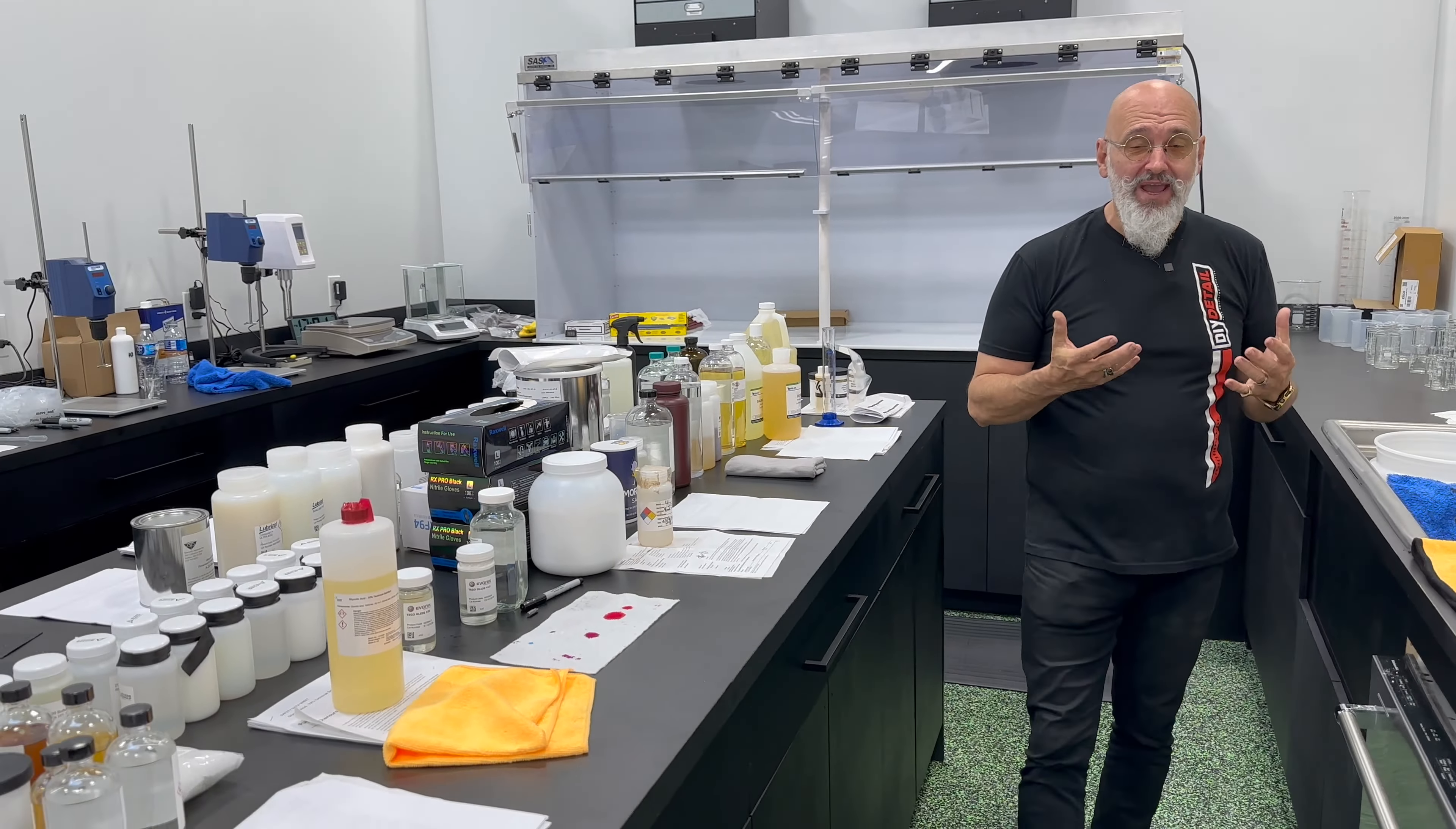This machine is almost here as a joke because every coating company tells you their pencil hardness test. This is the machine that does the pencil hardness test. But in reality, the coating is not giving you a pencil hardness test. You're putting it over something that's much softer. So you have your paint that you're putting it on. You put it over the paint. The paint underneath it is much softer than the coating. The coating is not going to harden the paint underneath it.